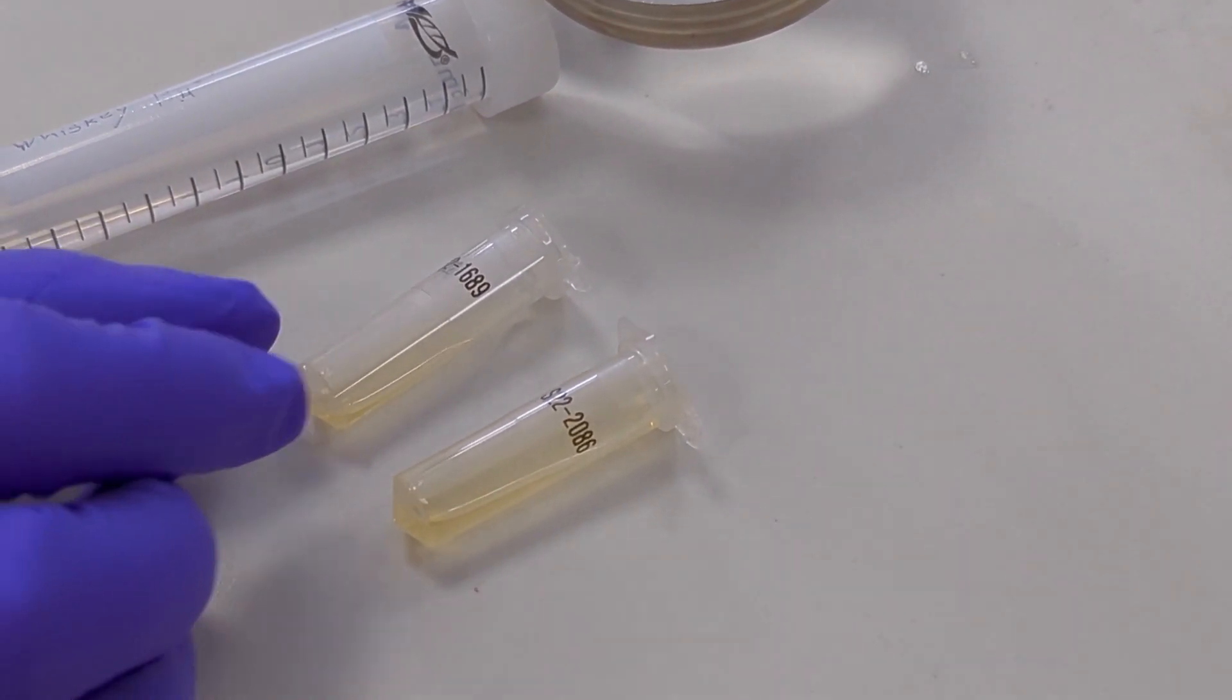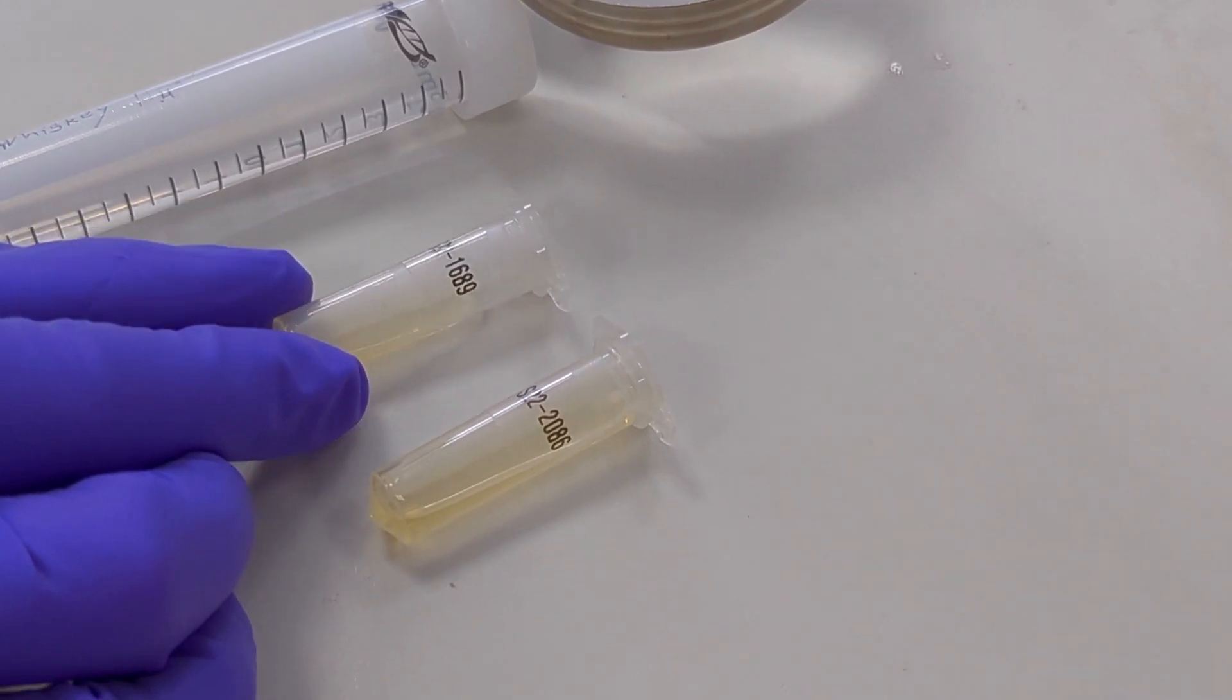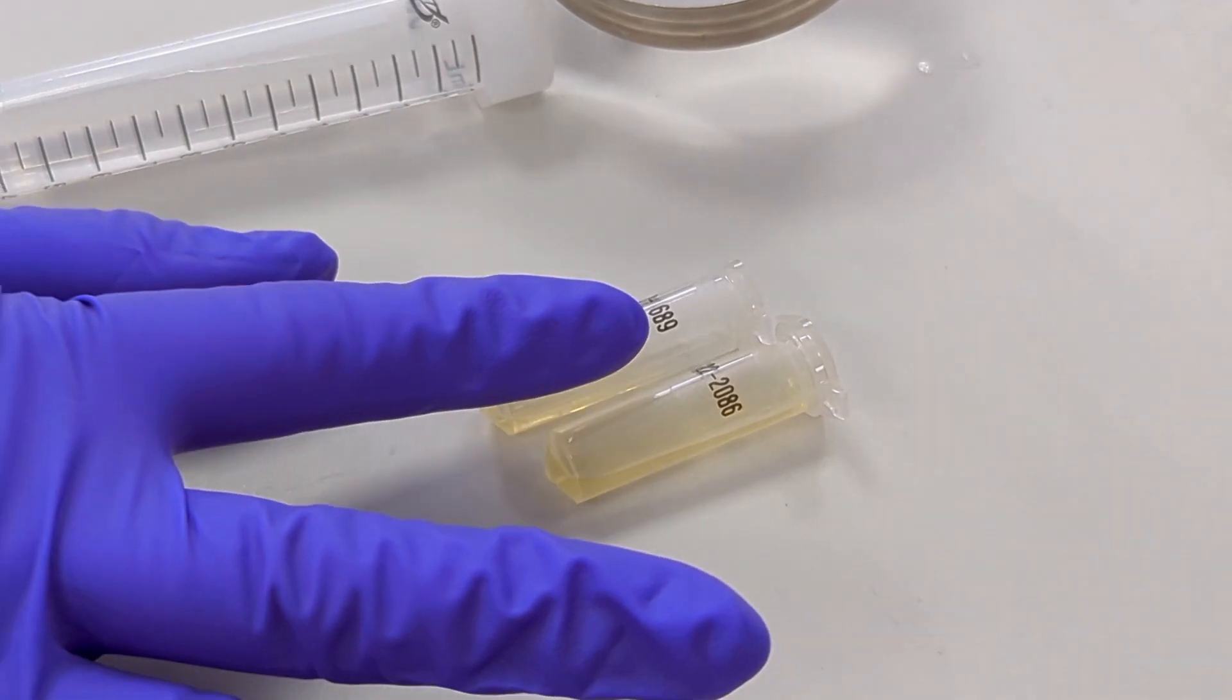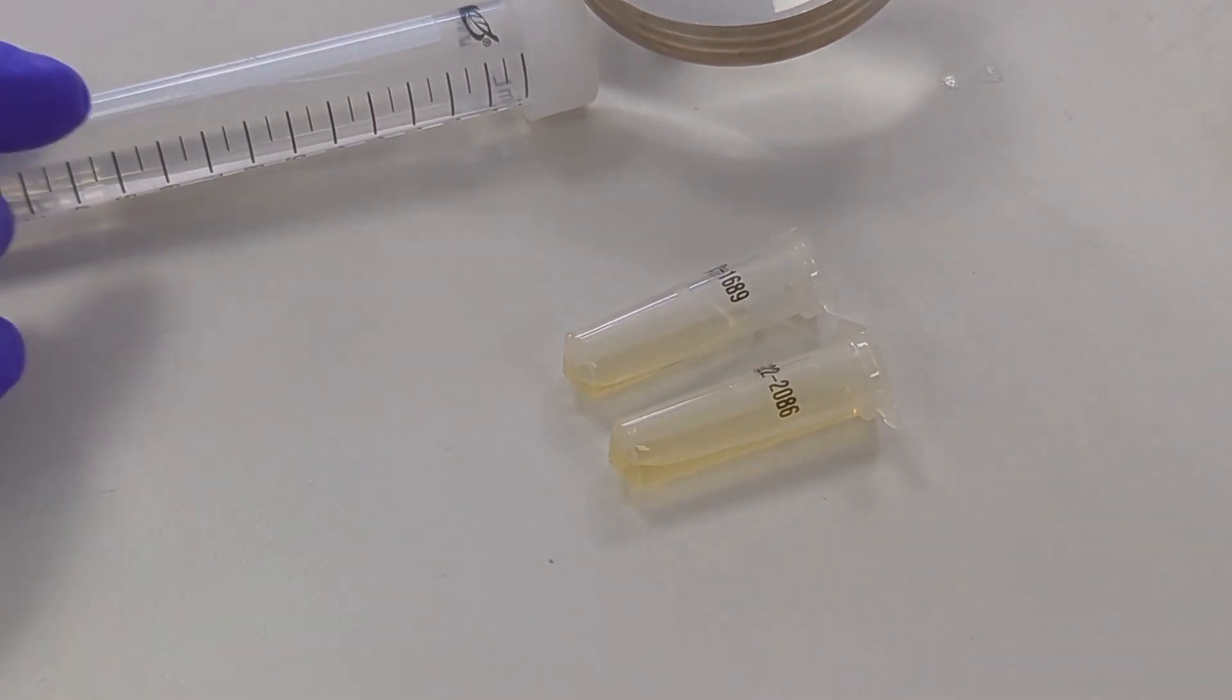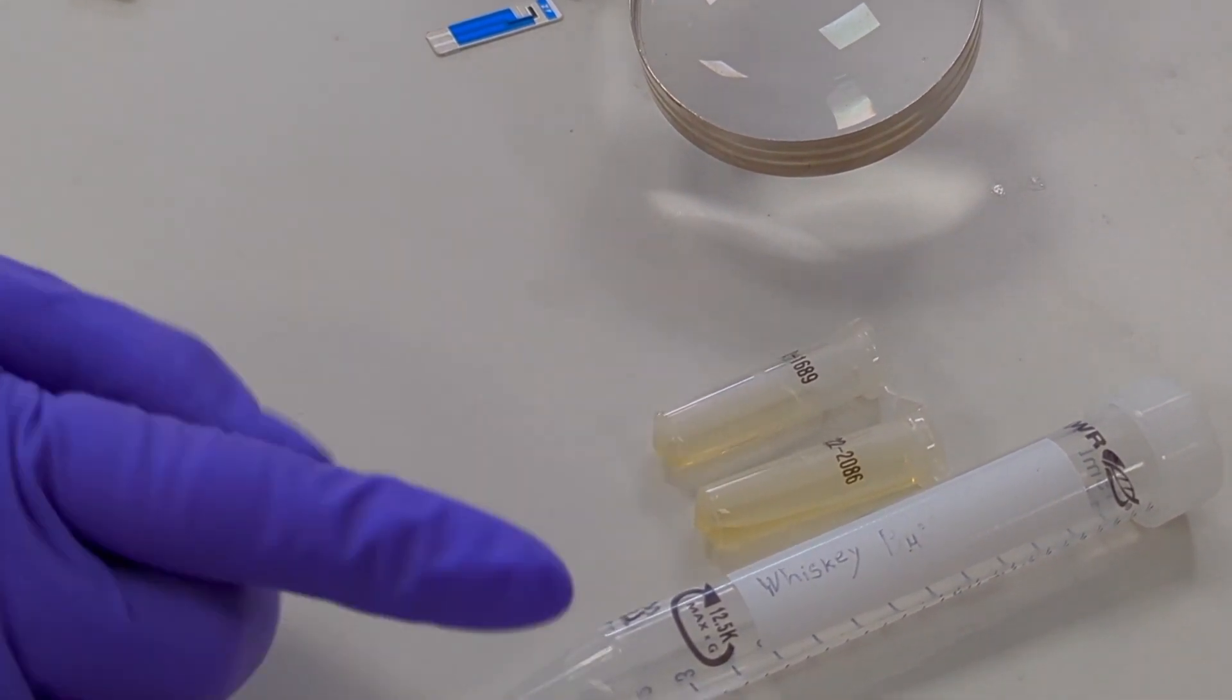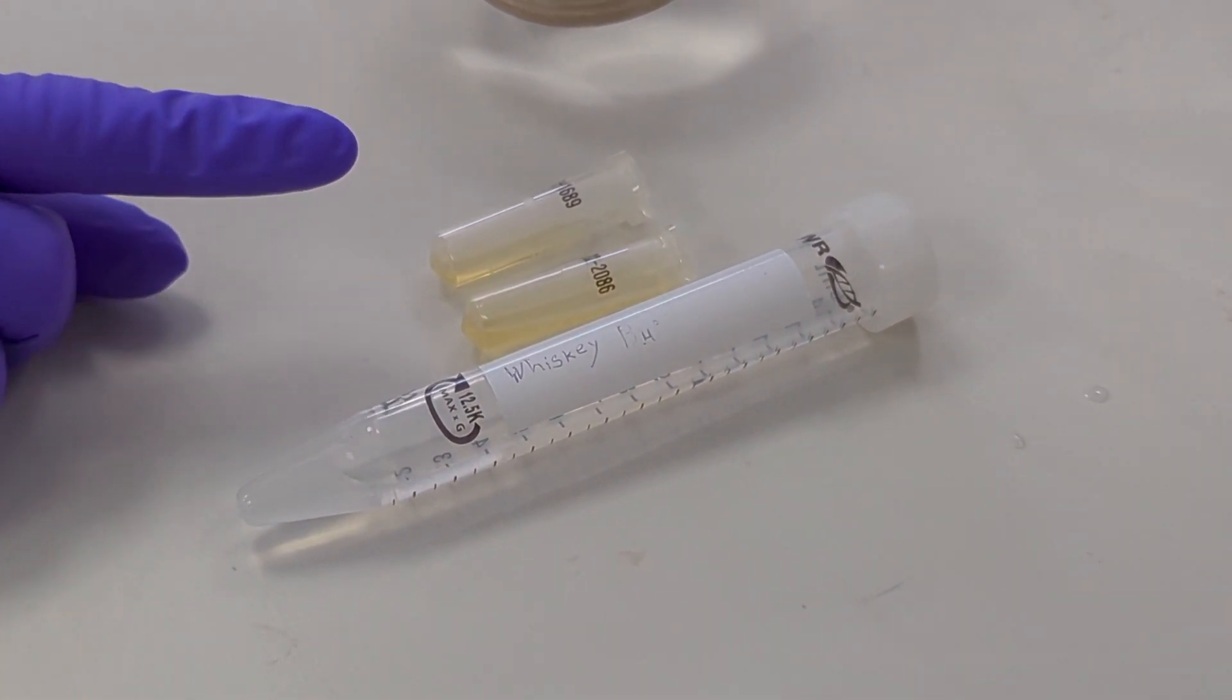Hi, today we have two whiskey samples, out of which one is genuine and the other one is adulterated whiskey. Now we don't exactly know which one's which until we test both of them on our sensors. We also have a whiskey buffer solution that we use to dilute the whiskies in order to test them.